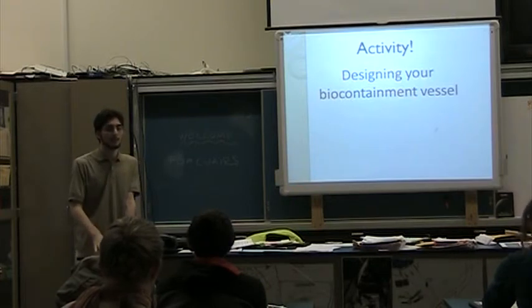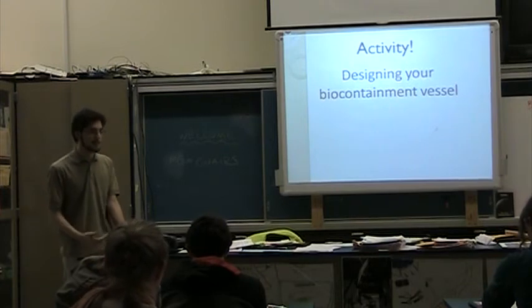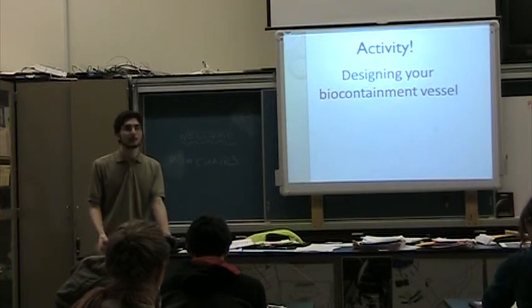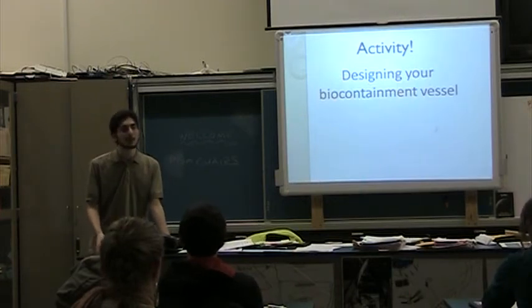Okay, so if you look at your primer there, the one with the box, it describes the category B biological substance shipping procedure or definition.